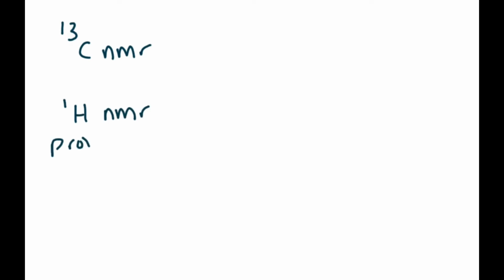Interestingly, NMR only works for odd mass number. So if it's an even mass number, like in deuterium, the isotope of hydrogen, then that doesn't show up, it is not detected on NMR.